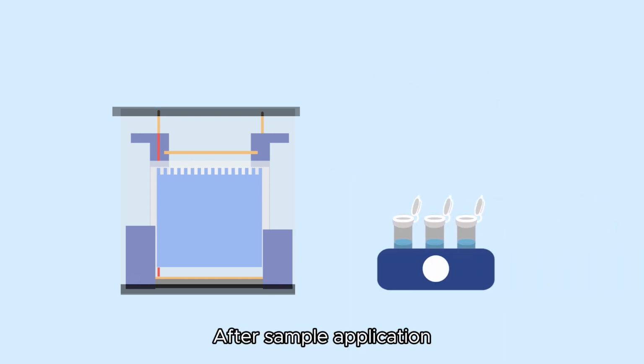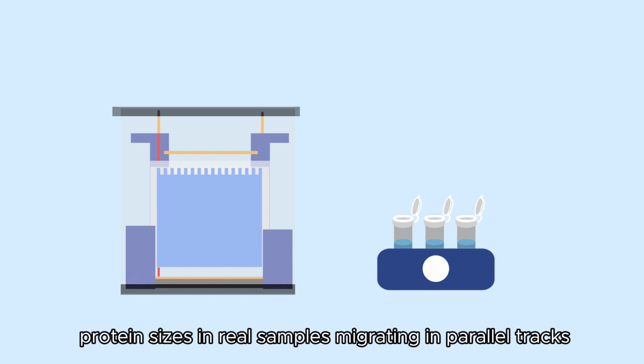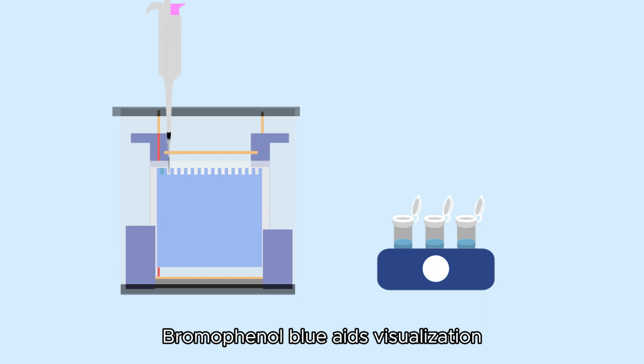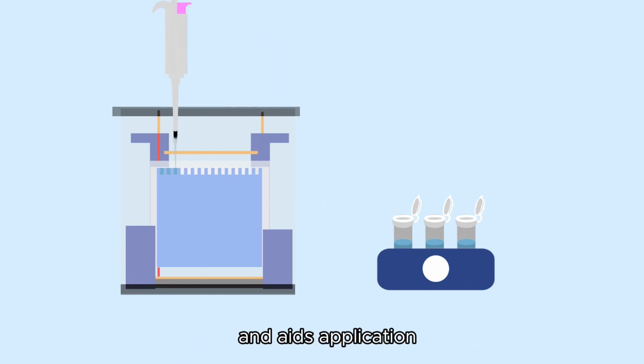After sample application, an electric field is applied across the gel. Each sample is placed in individual wells on the gel with bromophenol blue and glycerol. Bromophenol blue aids visualization, while glycerol enhances sample density and aids application.